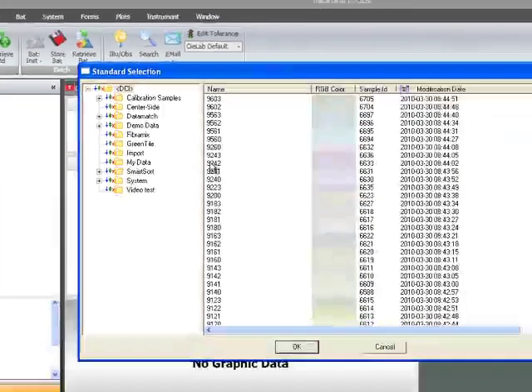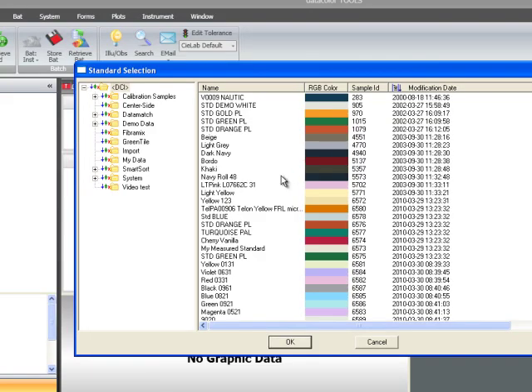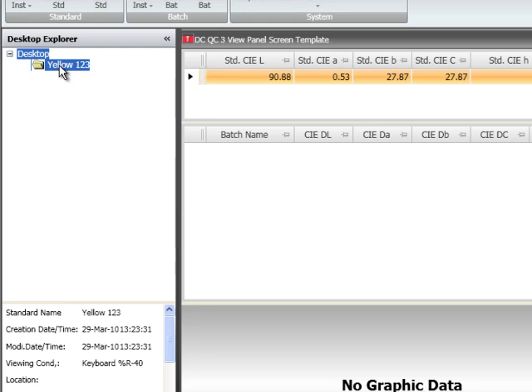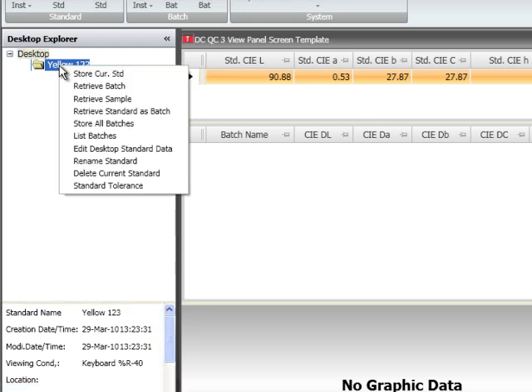Once a standard is added to the desktop and that standard is highlighted, the desktop explorer offers information on that standard. If a user highlights a standard and right-clicks, new options are available associated with that standard. Options such as store current standard, retrieve batch, retrieve sample, retrieve standard as batch, and many others are available.